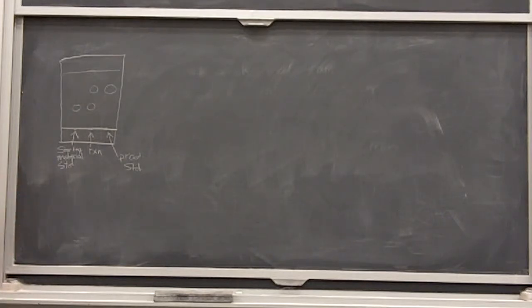Now, RF values are not like melting points. So you can't say, well, this reaction mixture had two things in it, it's not very pure, so the RF values got lowered, okay? They're not like melting points, which lower when you have multiple things present. They are what they are, okay? So you don't lower an RF value due to impurity. An RF value is an RF value for a specific compound, all right? And you will see those specific compounds when you develop the TLC plates. You will see the difference between them because you'll have different spots.